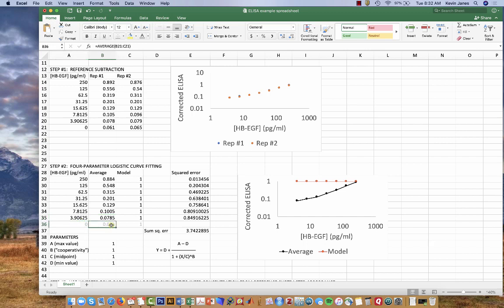The first step in doing nonlinear least squares curve fitting, and I want to emphasize at this point, what I'll talk about in the early stages is general to any nonlinear least squares curve fit. We'll talk specifically about the 4-parameter logistic model of the data, but you could use this for a hyperbolic function, or any other type of curve fitting that you need beyond simply the pre-built ones that come with the Excel graphing software.